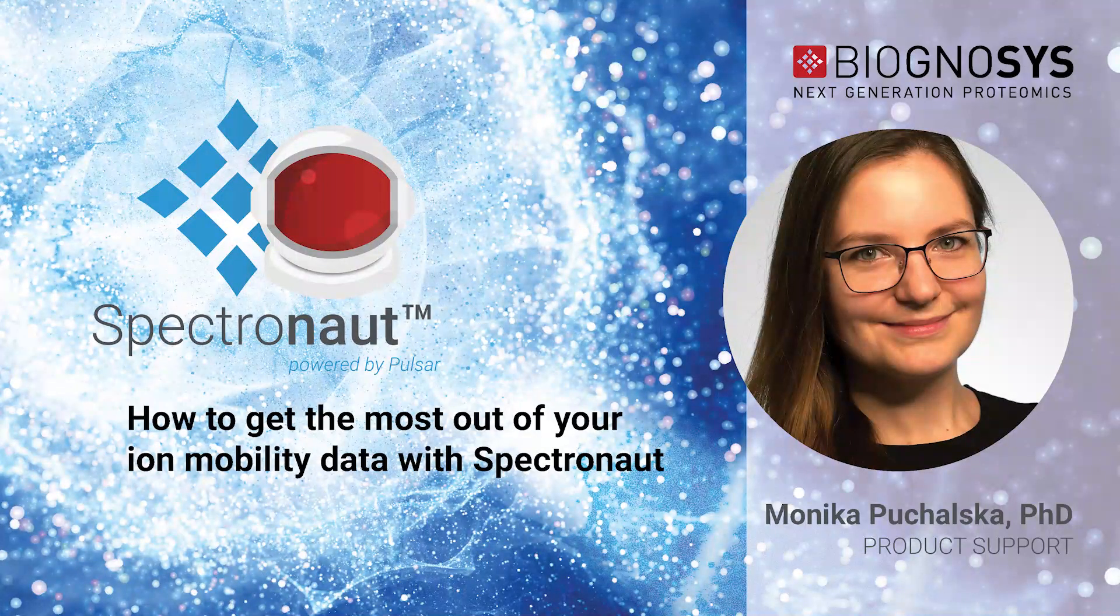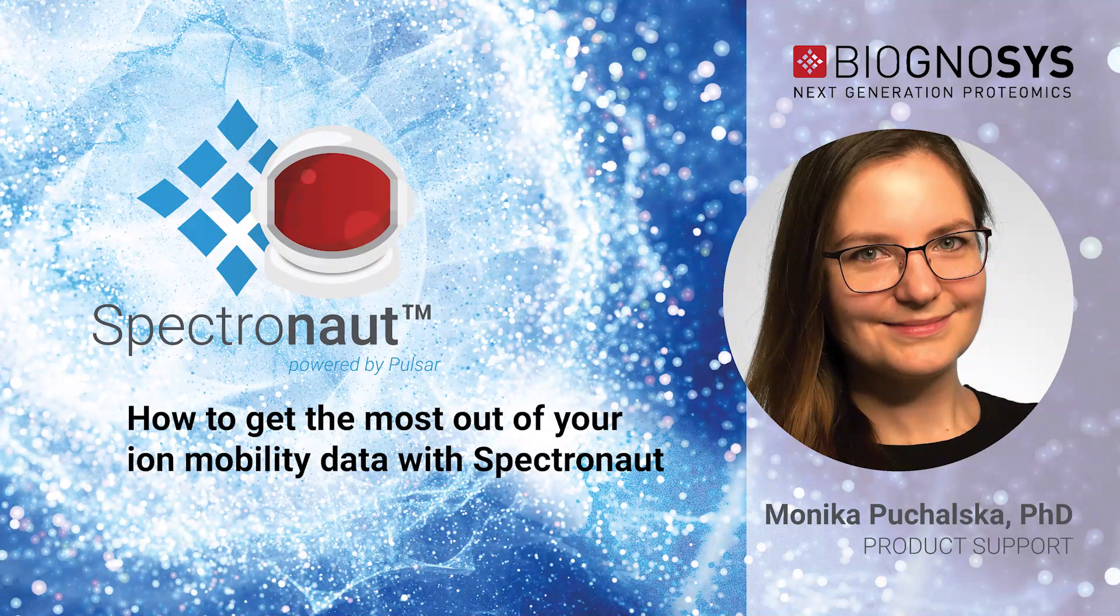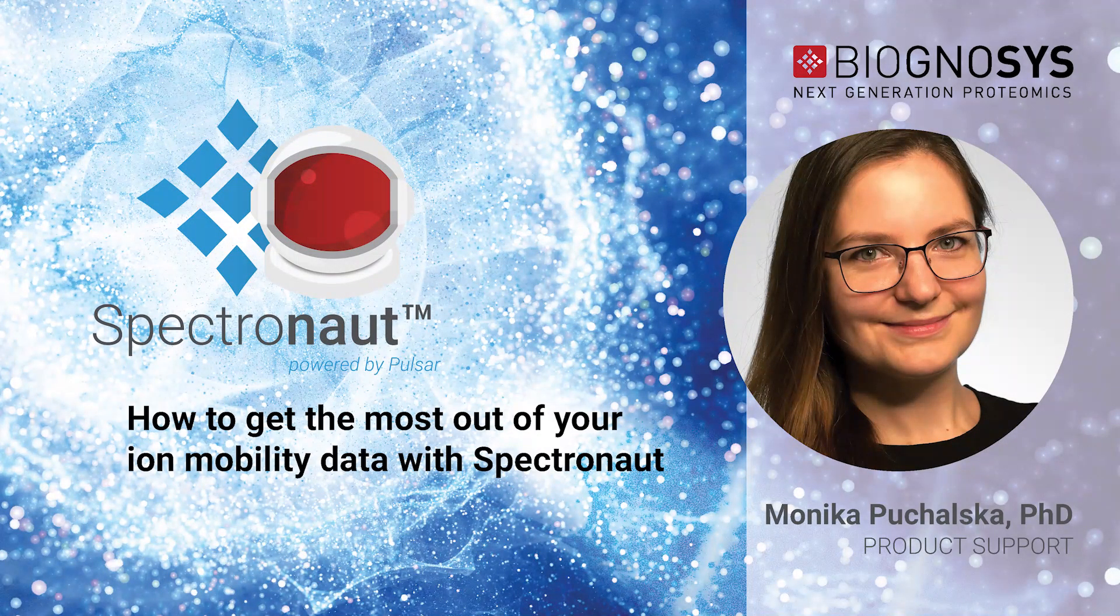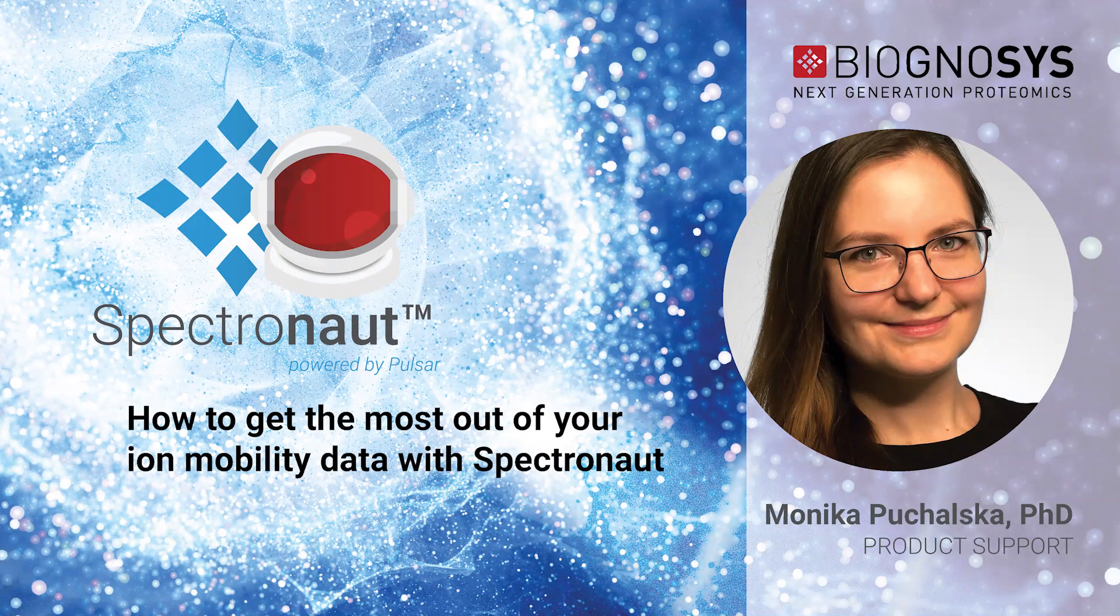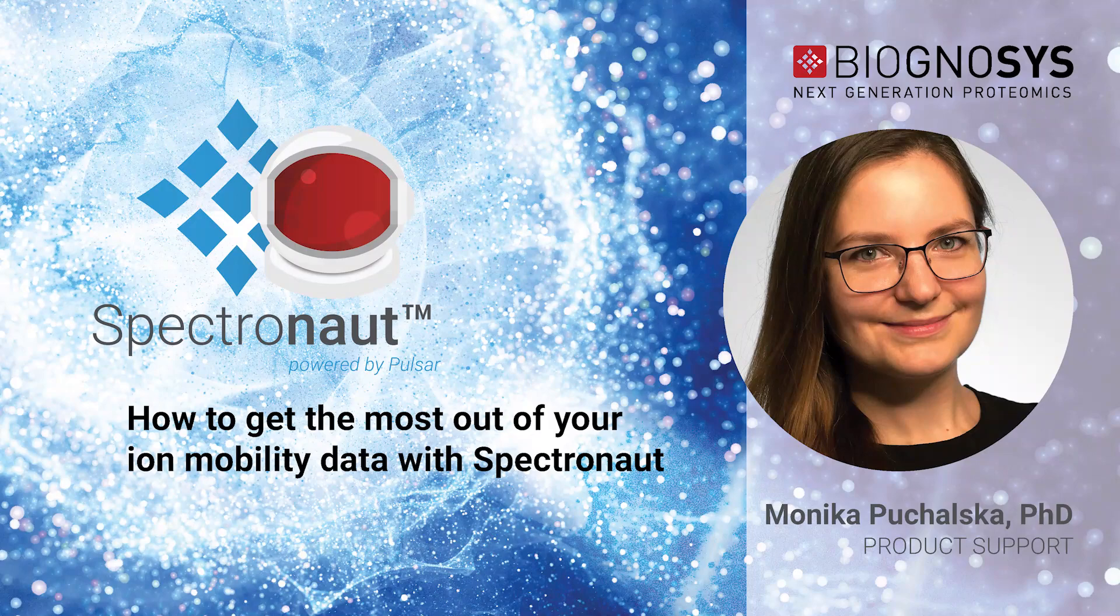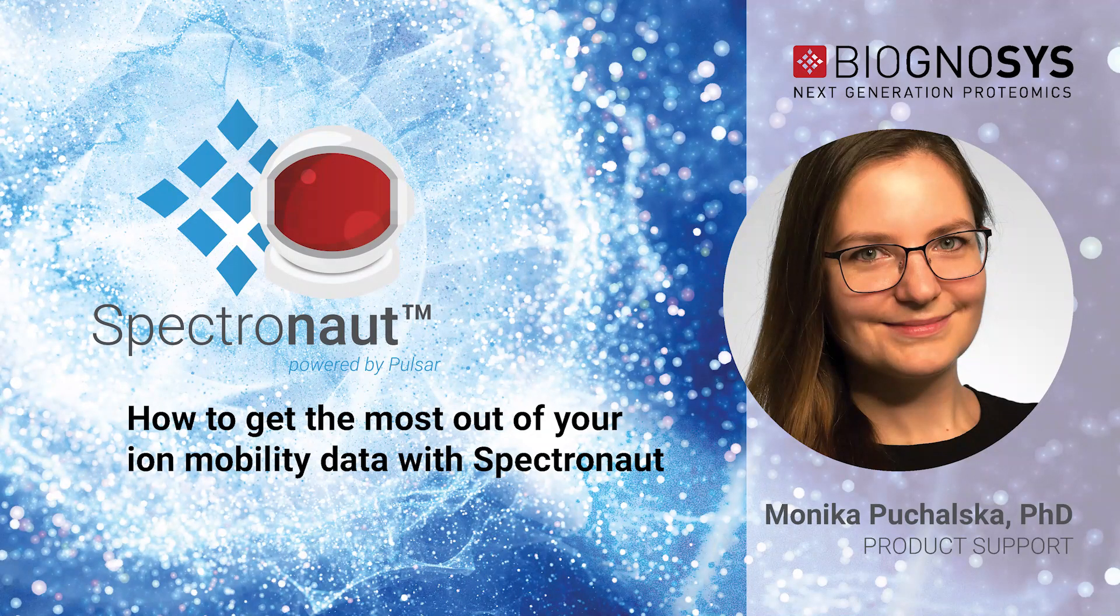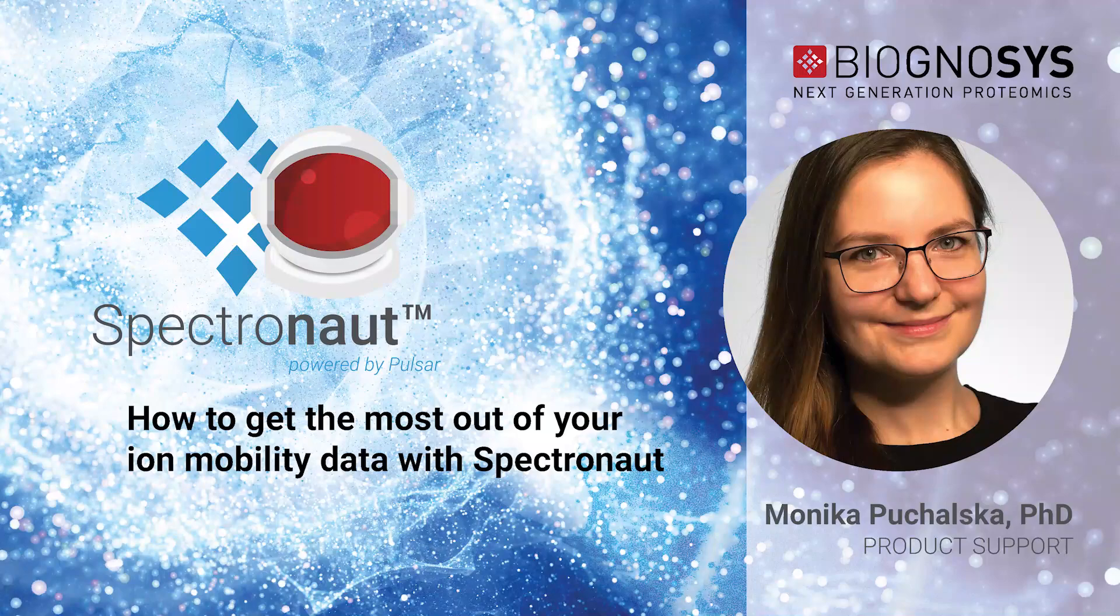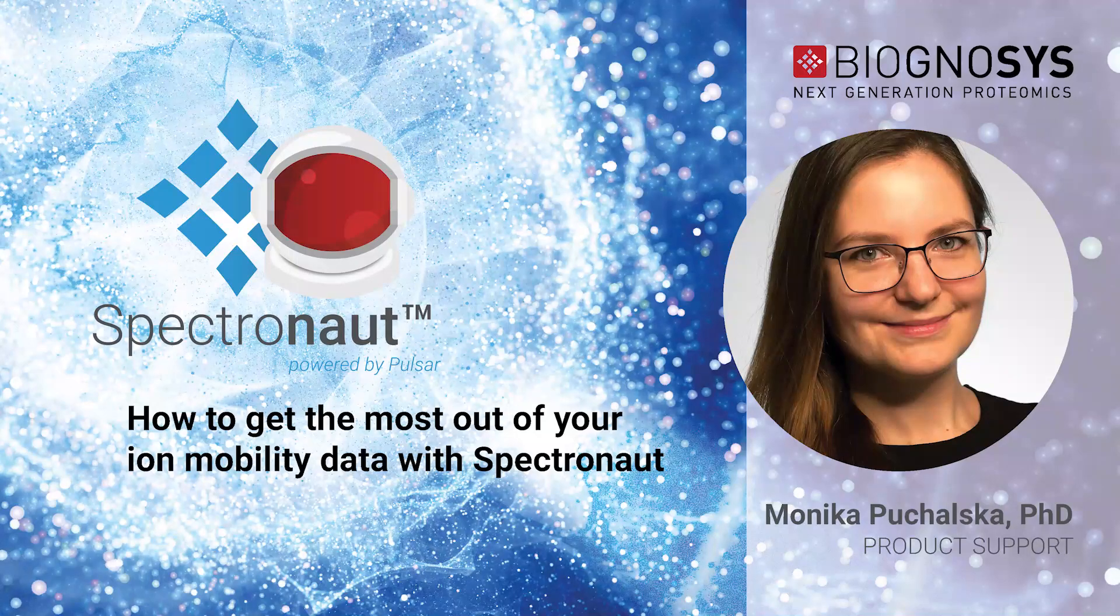Hello, my name is Monika and I joined the Biognosys support team in May 2020. Today I'm going to introduce you to the implementation of ion mobility data processing in Spectronaut.